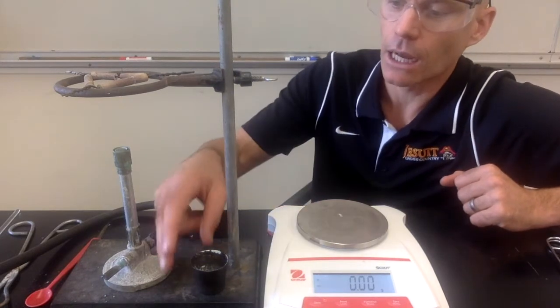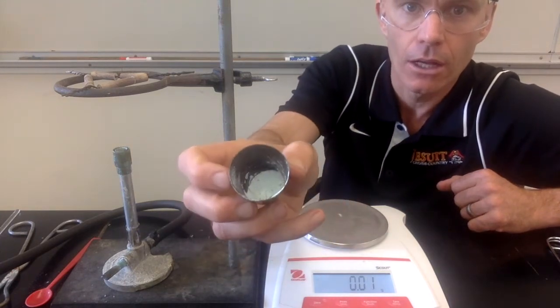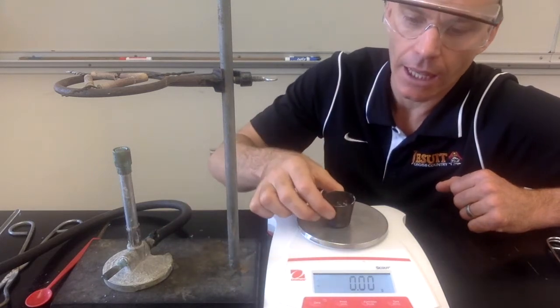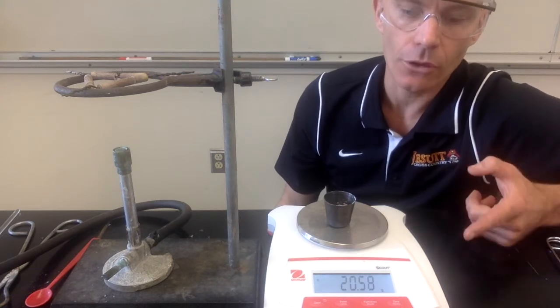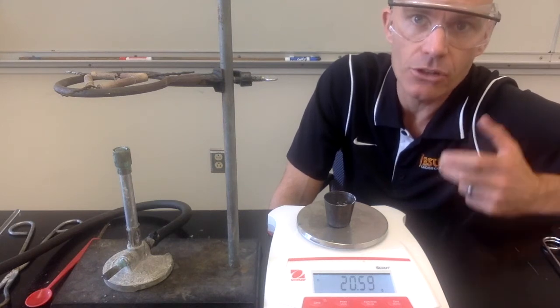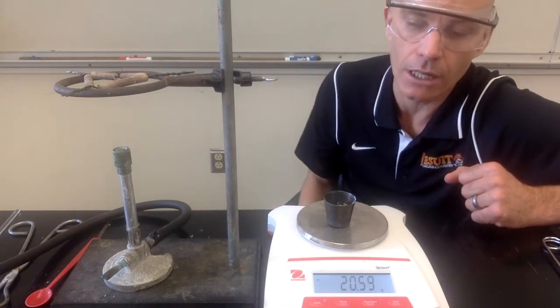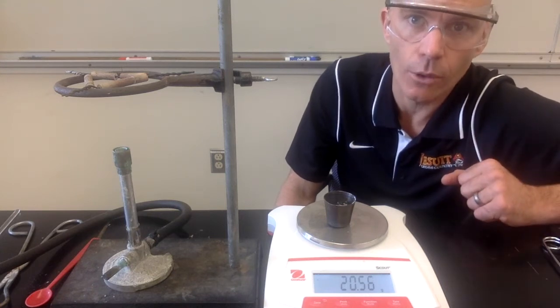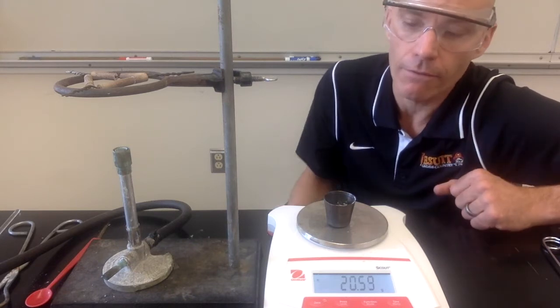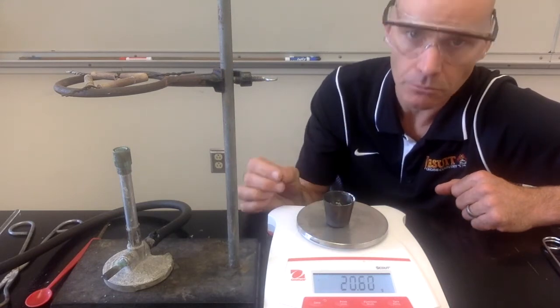We heated this a second time and let it cool. If you look at it, pretty much all that blue color is gone — it's a fine white-gray powder. We'll weigh it again and find the final mass. Notice that between the first and second heating it did lose a little more weight, which means during the first heating we didn't drive all the water out. It was actually necessary to heat it a second time to make sure all the water was removed. Based on its color, I'm pretty sure we got all the water out.